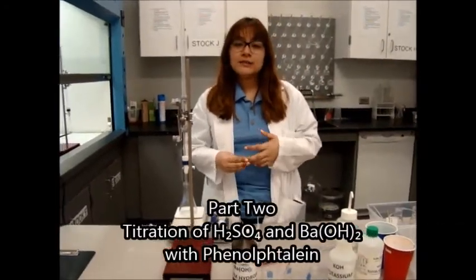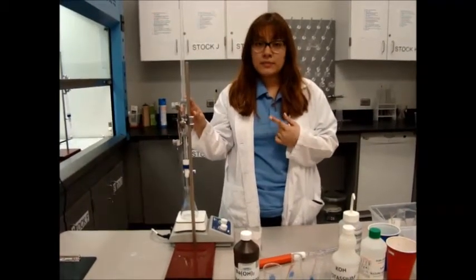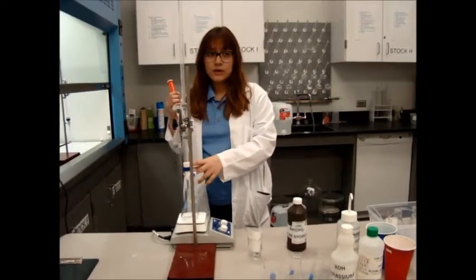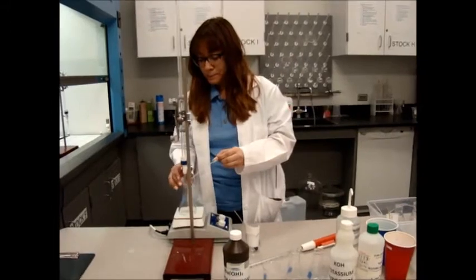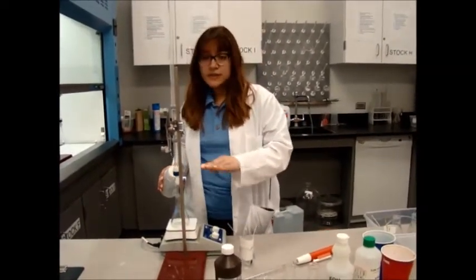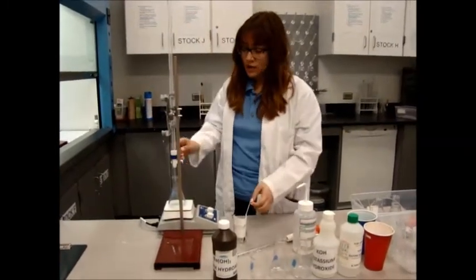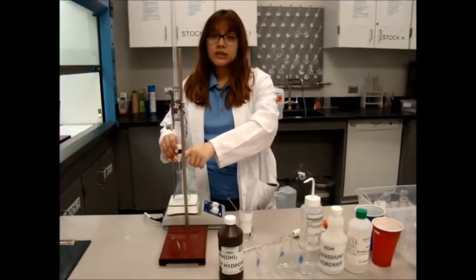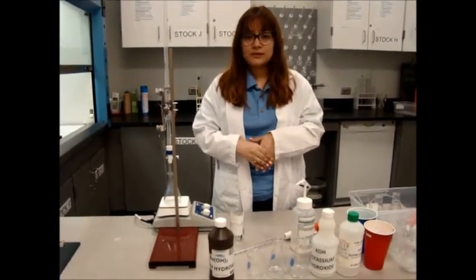Welcome to part 2 of your practical exam. This is another titration of sulfuric acid and barium hydroxide but with a different indicator. You should already have 15 ml of sulfuric acid inside the burette. Take 10 ml of barium hydroxide from the bottle and deliver it into the conical flask. Then add two drops of phenolphthalein. Take the distilled water and use it to cover the surface of the magnet. Record the initial volume (Vi), then open the valve and allow the sulfuric acid to flow until you see a color change. Quickly turn it off, record the final volume (Vf), then calculate the total volume (Vt). That concludes the second part of your practical exam.